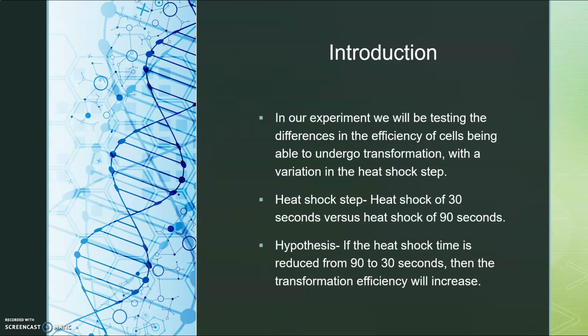The impact of changing the time, whether increasing or decreasing it, is sure to be exhibited in some way on the plates due to the fragile nature of the bacteria. This being said, from our experiment, we reduced the heat shock time to 30 seconds, which we hypothesized would increase the efficiency of the transformation. Our reasoning lay chiefly in our belief that the bacteria would have a greater rest period before being put back on ice with only 30 seconds rather than 90 seconds in the heat shock, thus improving the transformation efficiency rate in comparison to last week's experiment.